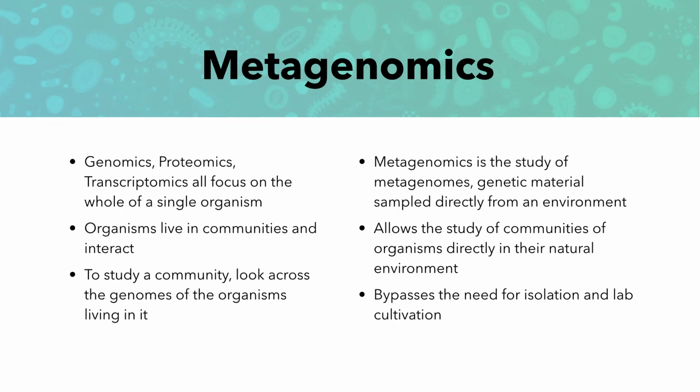This allows us to bypass the need to take a single representative and culture that bacteria in a lab. And it allows us to maintain the natural environment, but also the composition, because the proportions of different types of bacteria together, and also different types of interaction, are important. So we can really look at that community from a number of different ways.